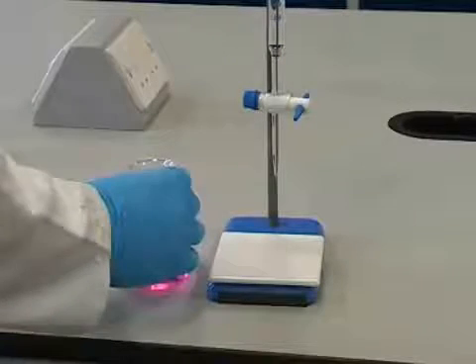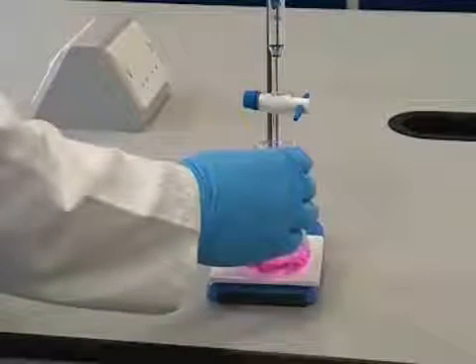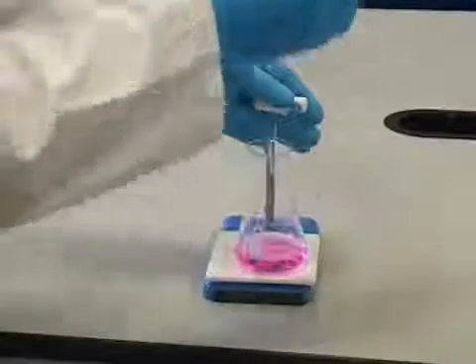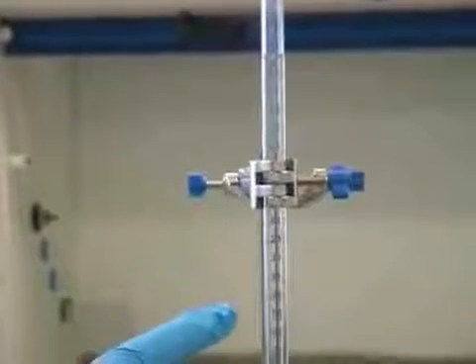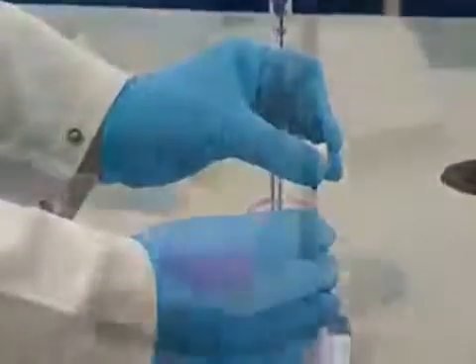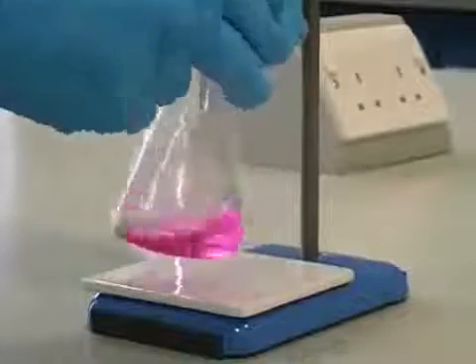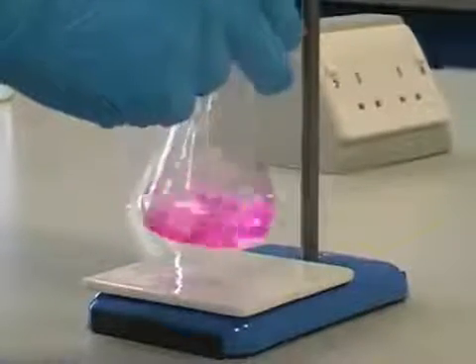In this case we've added just over 16 centimeters cubed altogether, so we can reasonably expect our accurate titrations to require somewhere in the region of 15 centimeters cubed of solution. So we're going to add about 14 centimeters cubed by going very quickly from 19 centimeters cubed to 33 centimeters cubed on the burette. Here you can see the solution running in quickly.